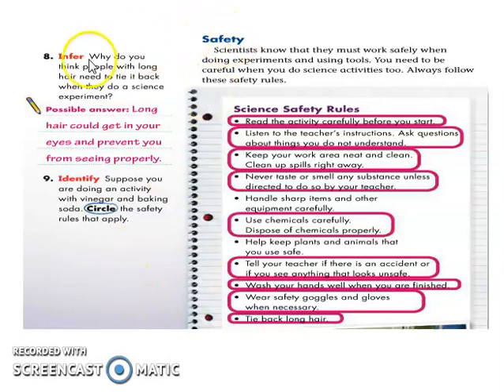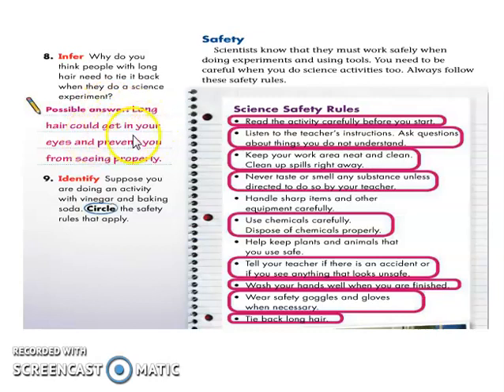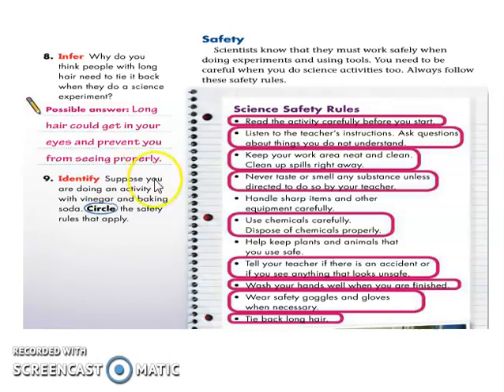Here in number eight: why do you think people with long hair need to tie it back when they do a science experiment? A possible answer: long hair could get in your eyes and prevent you from seeing properly, or it could burn when you're doing an experiment using a burner. That's why it's important to tie back your hair.